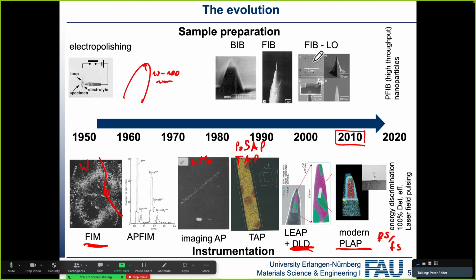But grain boundaries, already a problem. How do you work on grain boundaries? Here you can see a grain boundary. So how did they get the grain boundary there? Well, you can use nanocrystalline materials, then you have grain boundaries everywhere as well.